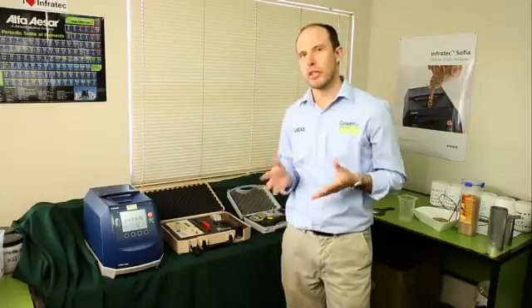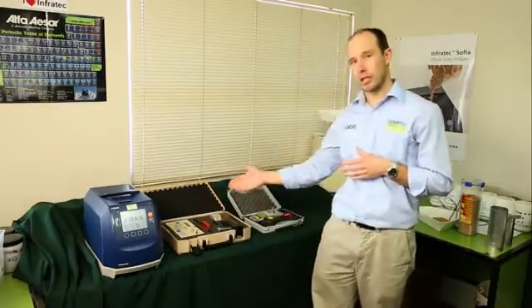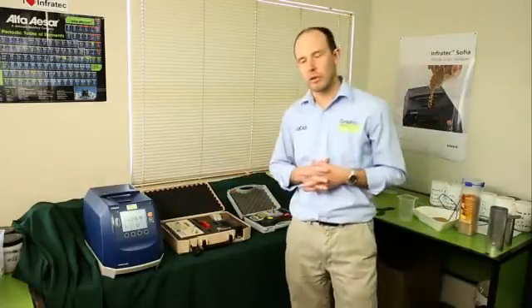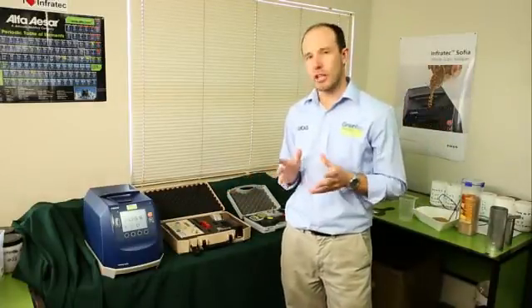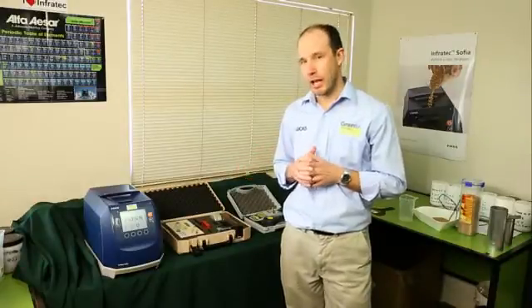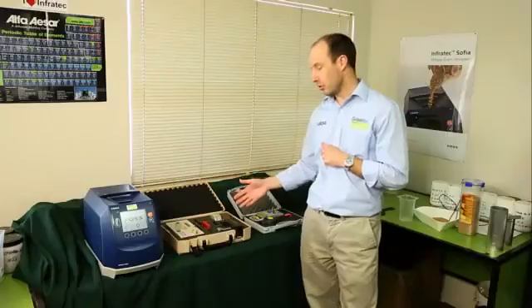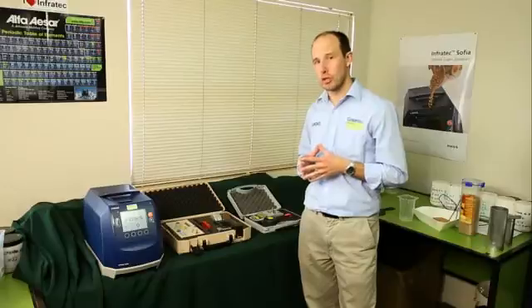One of the primary reasons is that the technology used in a handheld moisture meter, like the HE50 or the HE Lite or any number of other meters, and the technology that's used at a depot are completely different. Moisture meters like the HE50 use electrical conductivity to measure the moisture.